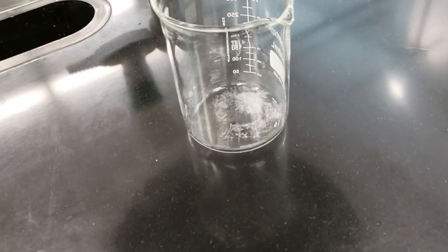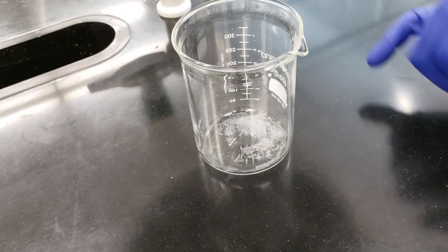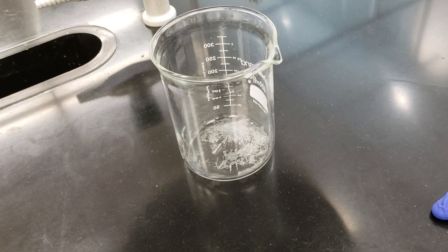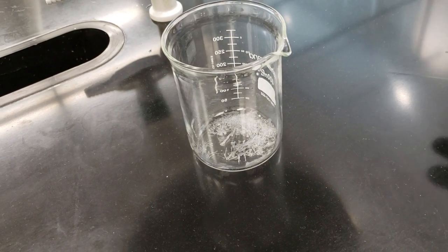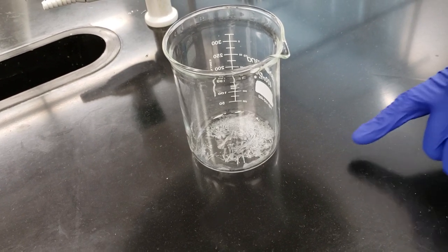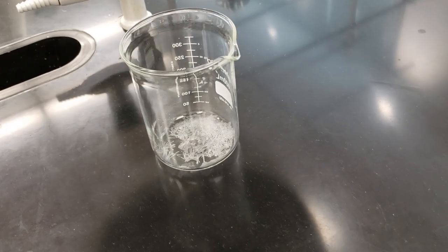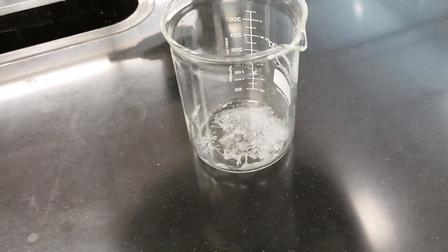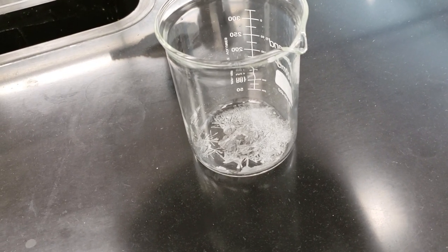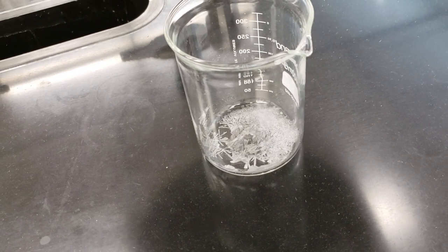So we finished evaporating off our ethyl acetate, and now we place the beaker on the benchtop, and as you can see, our crystals are starting to form in the bottom of the beaker. As this approaches room temperature and gets a little bit cooler, that crystal formation will intensify. It's in fact happening right in front of our eyes. Once it's finalized, we'll crush this into a powder using our glass rod. So we'll leave it here for a few minutes to cool down, come back, and turn it into a powder so that we can dry it further in the oven and then get our IR and NMR measurements.